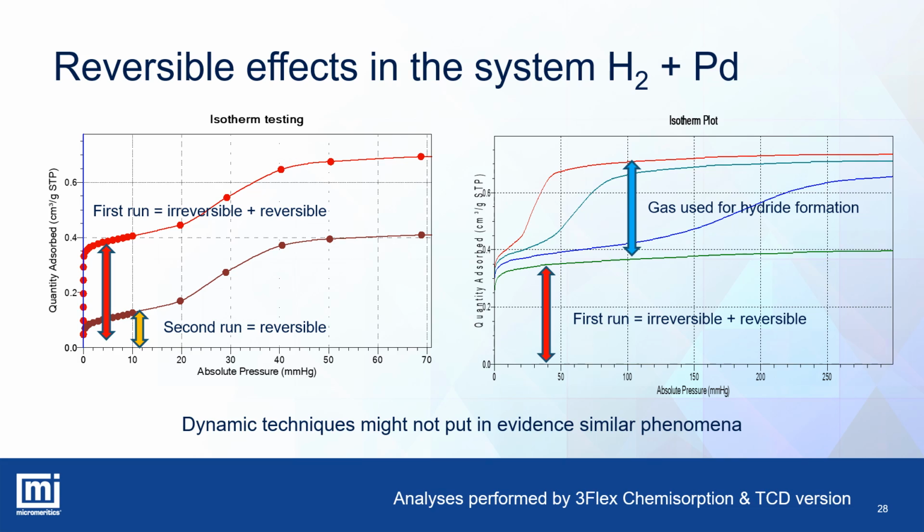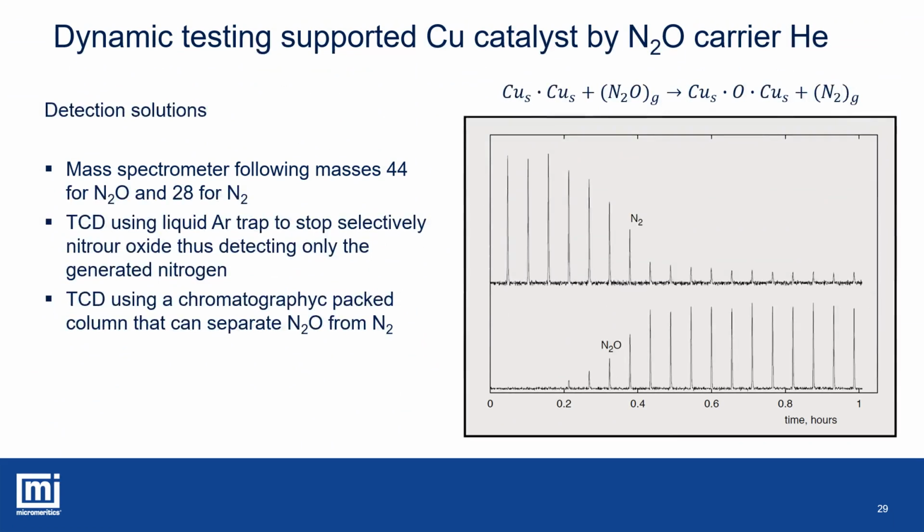The characterization of some supported metals like copper or silver is quite difficult with the static manometric methods because the most used gases like hydrogen and carbon monoxide cannot give a stable chemisorption, and oxidation is disadvantaged. In these cases, a stronger oxidant is necessary, like nitrous oxide. This gas is likely to release atomic oxygen and nitrogen, so the decomposition of nitrous oxide is highly favored. Static manometric technique is not applicable in this case because 1 gas mole of nitrous oxide provides 1 gas mole of nitrogen, so in a static system the pressure will not change.